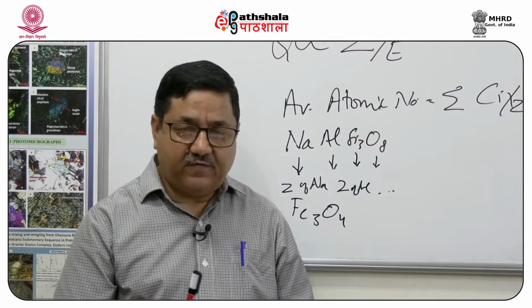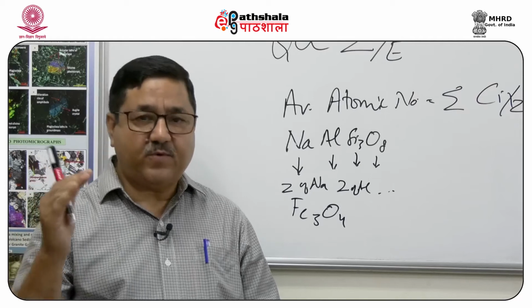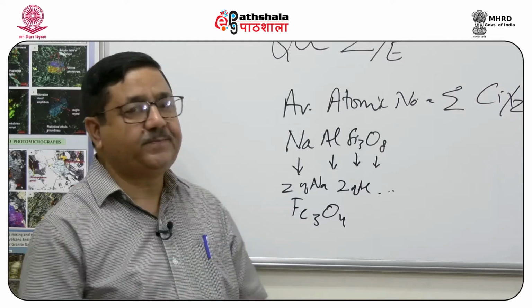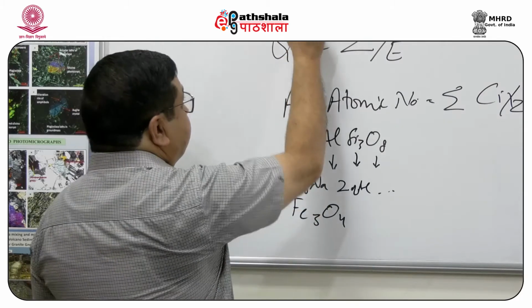The amount of elastically scattered back electrons in proportion to the incident electrons is known as the backscattering coefficient. This phenomenon of elastic scattering is called backscattering.